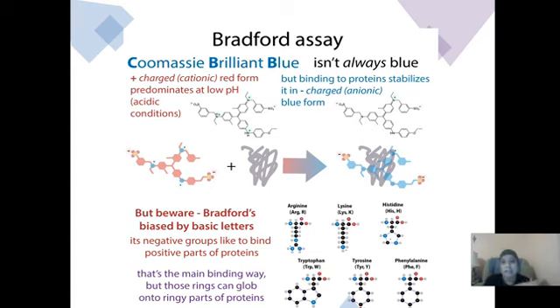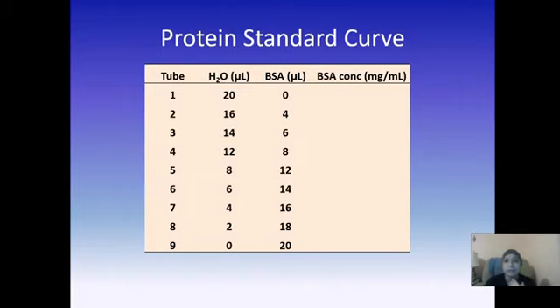So it's not necessarily that it's looking at all the proteins at the same level. There's another way that it also binds to your proteins, and that's because it has this ring-like structure. It can kind of hang on to the ring R groups in your amino acids. So tryptophan, tyrosine, and phenylalanine, which have those ring structures, would also kind of bind to it as well at some level. So you will have some of those represented in there as well.